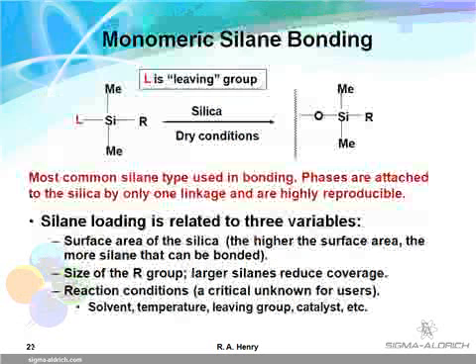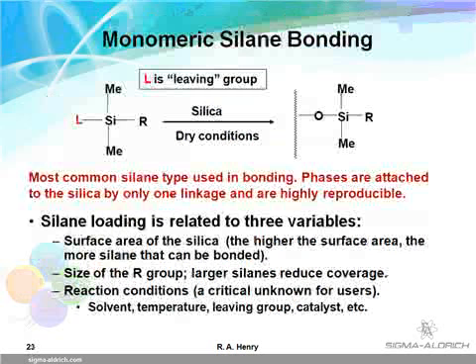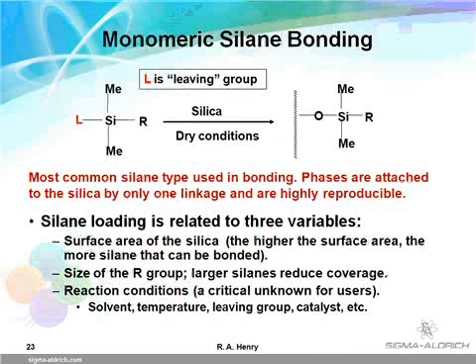The illustration in this new slide shows a monofunctional organosilane reacting with silica gel to form a stable siloxane bond. Although substrates can be used uncoated, the most important HPLC columns employ porous particles that are fully coated inside and outside with stationary phase. Bonding reagents are generally small enough to react with nearly all of the silica surface. However, larger reagents, such as C18, may require end capping for complete coverage.